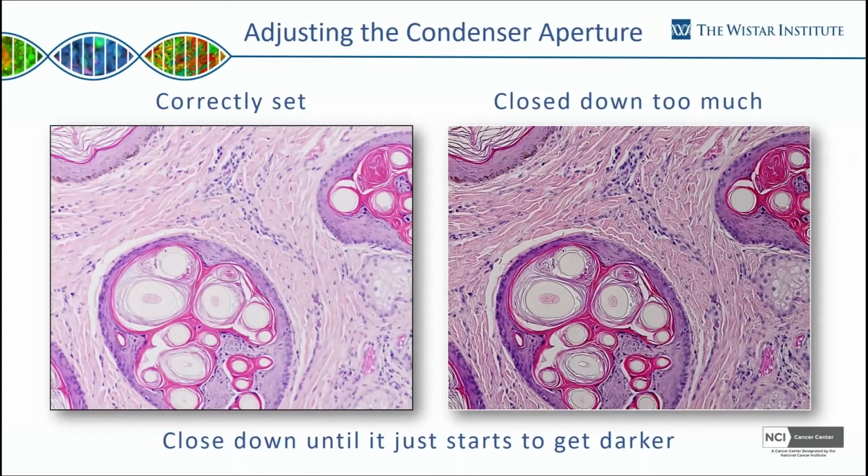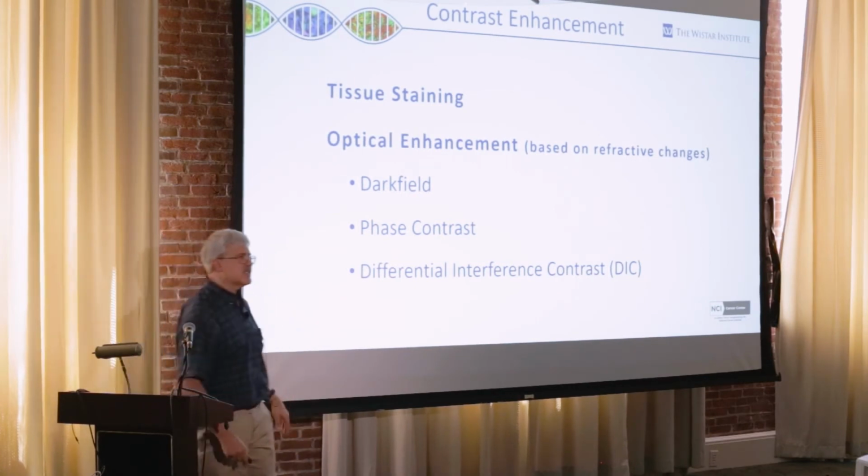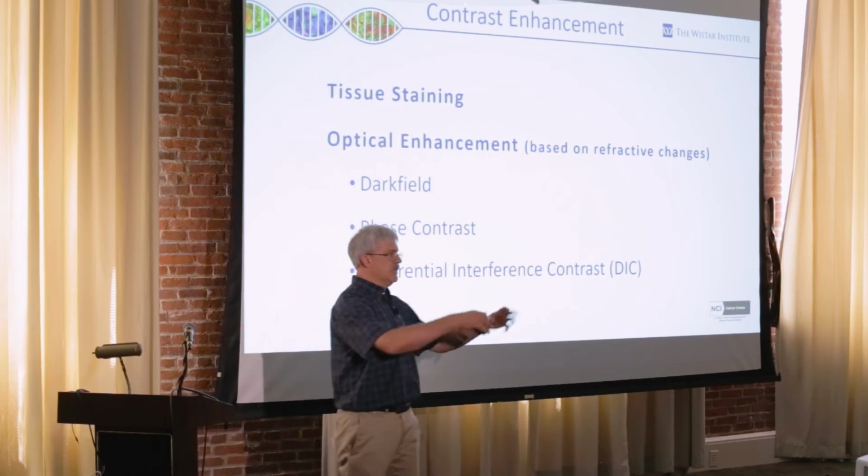So that's what I'm saying. You can get to the point where you overdo it. So if it gets too refractal, I'd back off a little bit. All right. That makes a lot more sense when you're sitting in front of the scope and adjusting it.